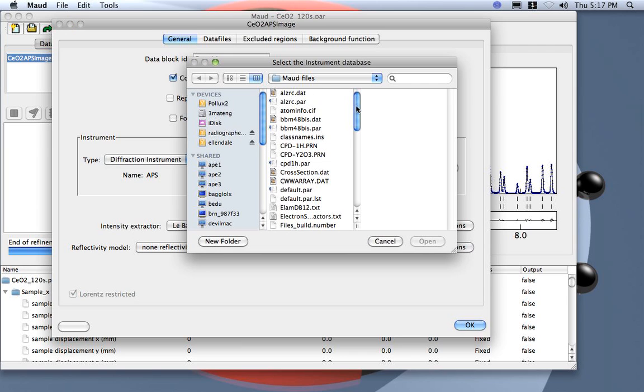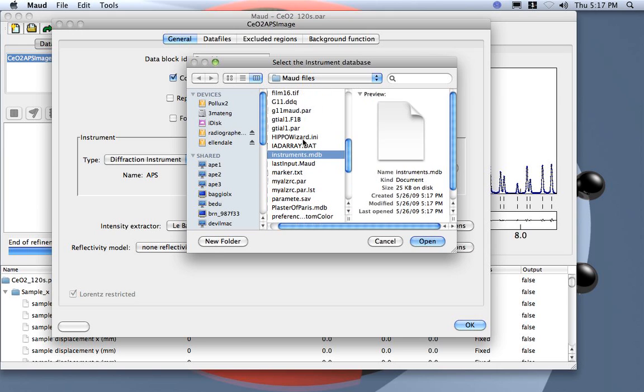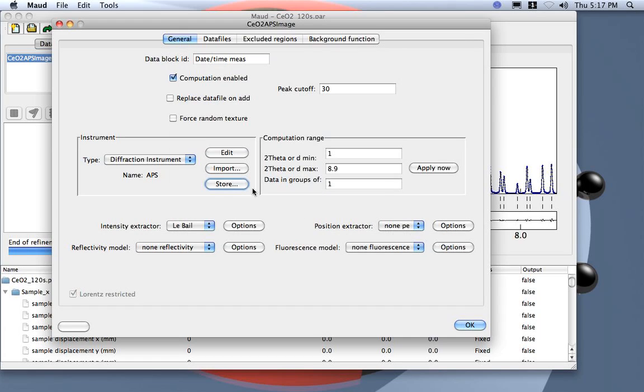For example, I can put it in a mode. In mode there is already one database instrument containing some examples, so I will just add to this one. Or you create a new file and add to the new file. Before doing this, just be sure to put a name to it so you can recognize it.